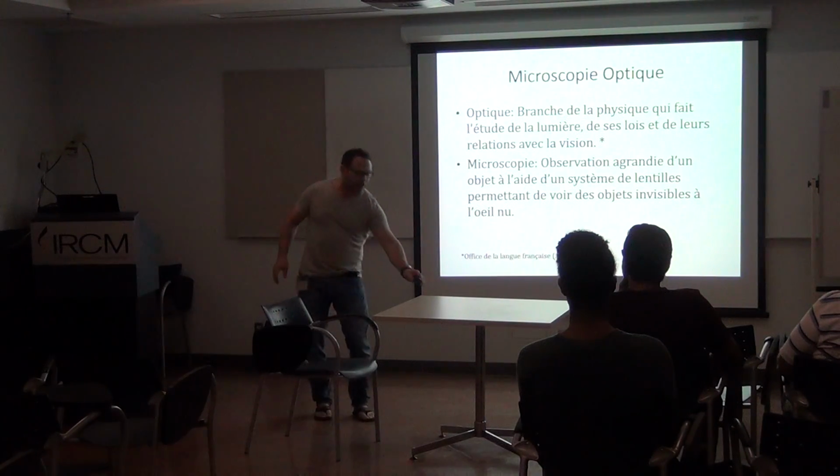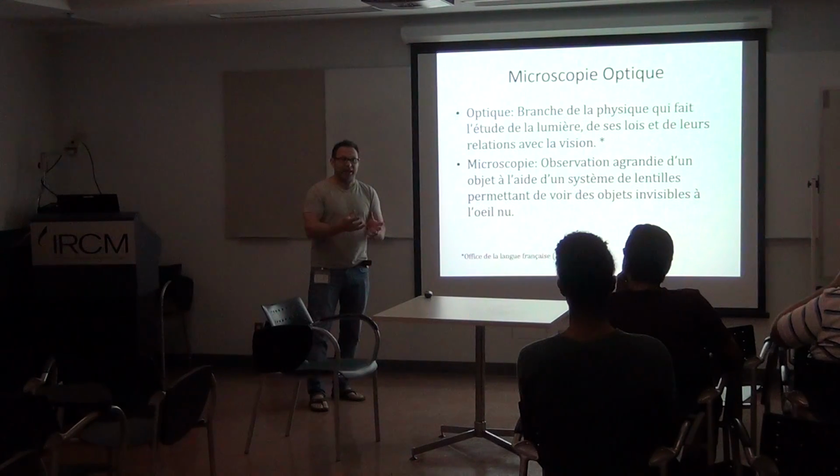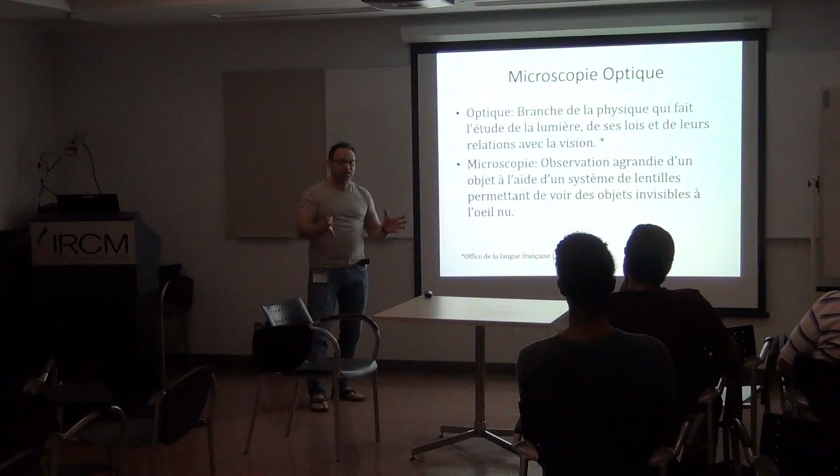An electron microscope where you need actually to shoot electrons into your specimen, and for that you need to put your system into an empty place. So the specimen needs to sit in an empty vacuum, because electron will be absorbed right away if it's in the air.